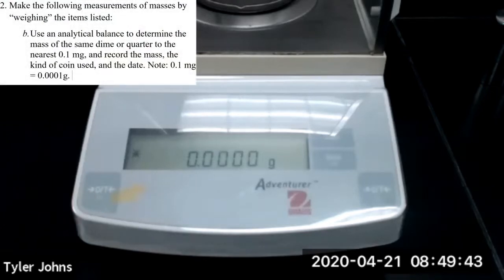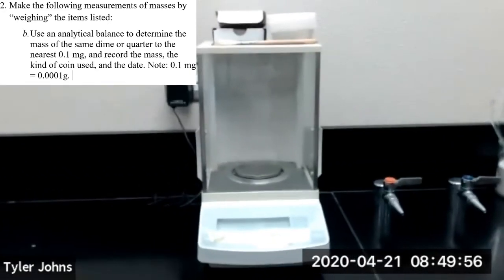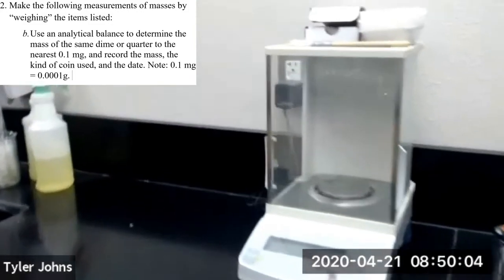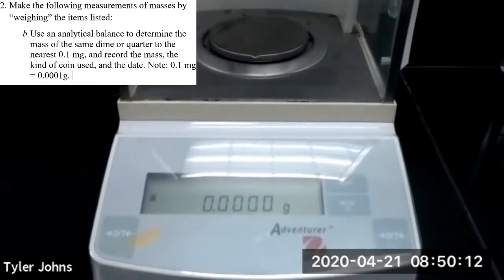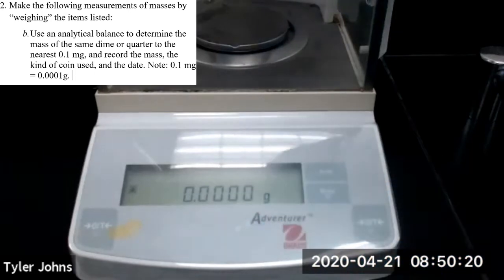So the next thing we're going to do is use an analytical balance to determine the mass of the same quarter. First I'm going to show you our analytical balance. So this is our analytical balance. And we'll now be using our analytical balance to determine the mass of the same quarter. So our analytical balance is at 0.